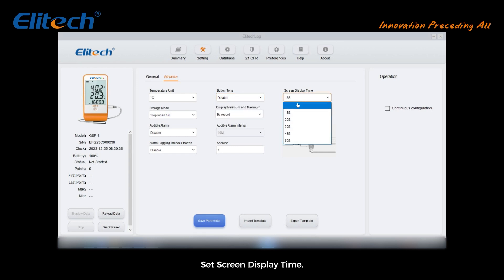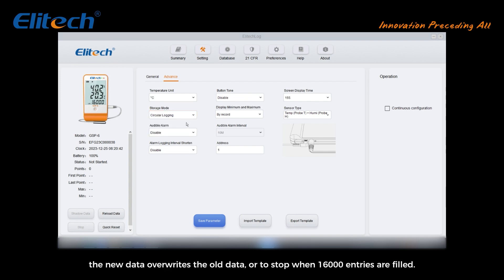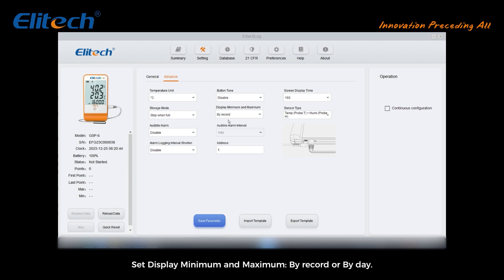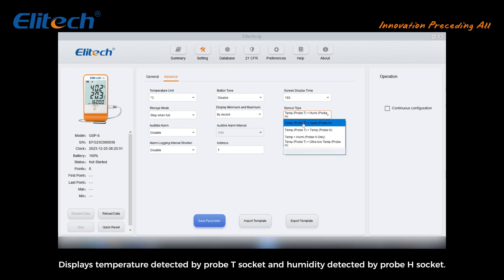Set the screen display time. Set the storage mode — whether to cycle after the record is filled, so new data overwrites old data, or to stop when 16,000 entries are filled. Set display minimum and maximum by record or by day. Set the sensor type: Temp Probe T plus Humidity Probe H displays temperature detected by Probe T socket and humidity detected by Probe H socket.